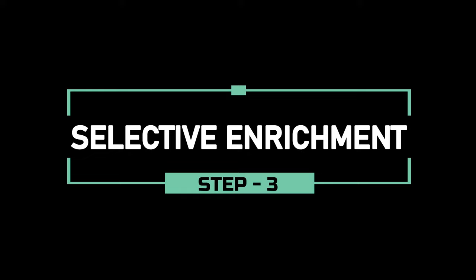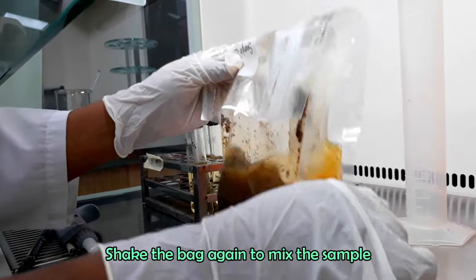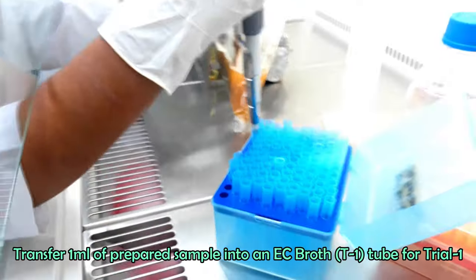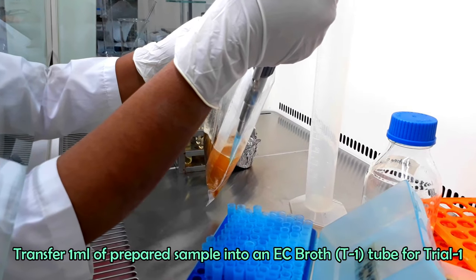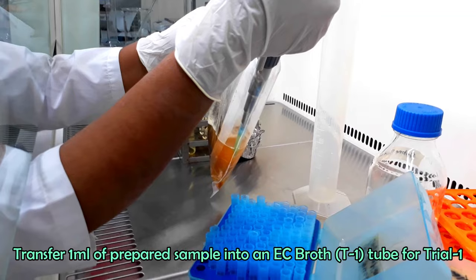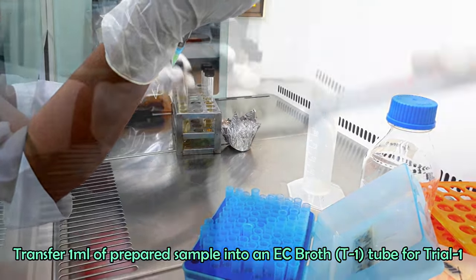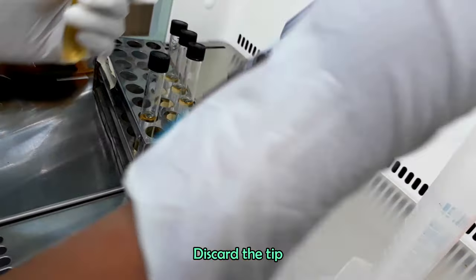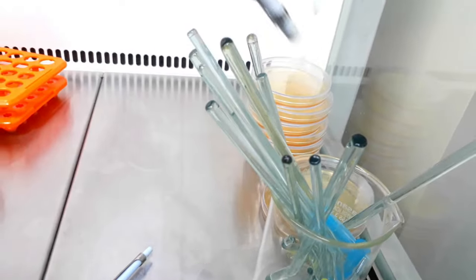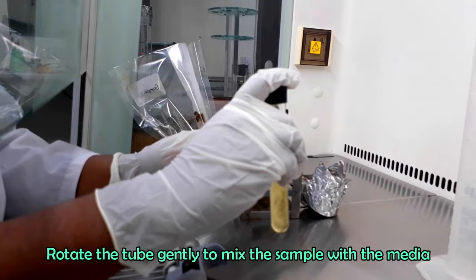This step is for the selective enrichment of E. coli. We will use two EC broth tubes for trial 1 and trial 2 to enrich E. coli of the sample. Attach a sterile tip to the micropipette and transfer 1 ml of prepared sample into trial 1 EC broth. Discard the tip. Close the tube with its cap loosely. Rotate the tube several times to mix the content.